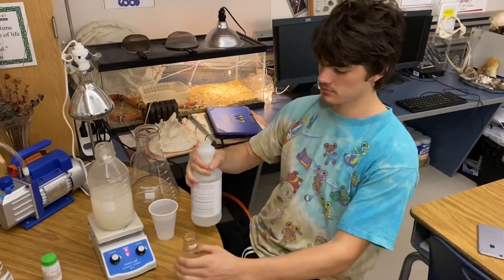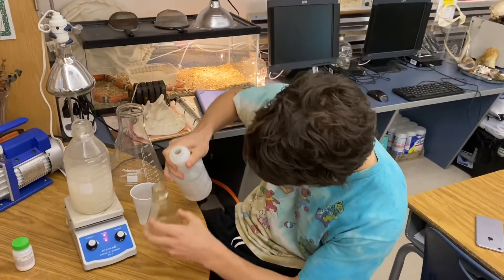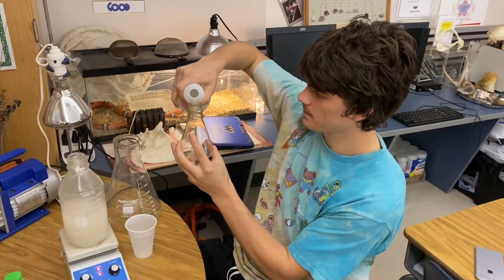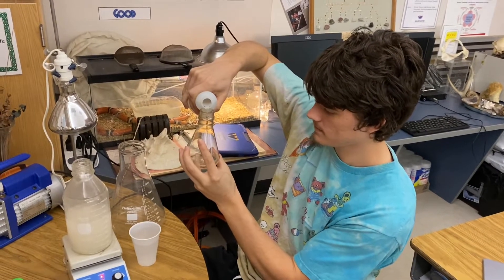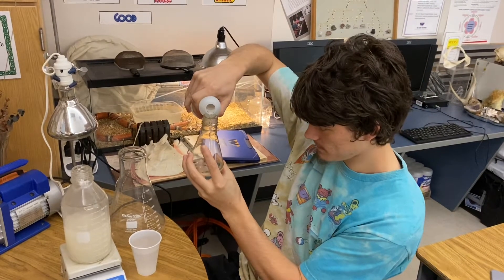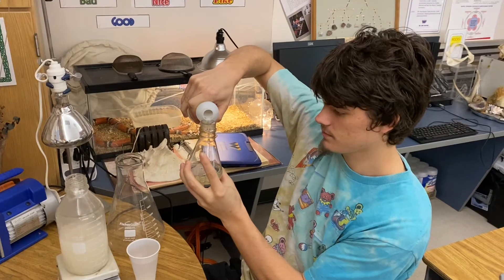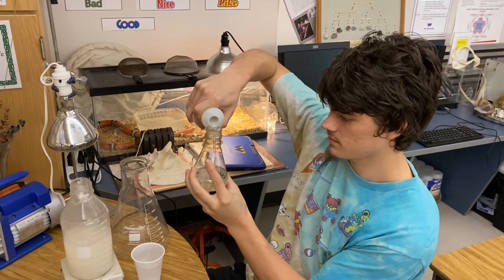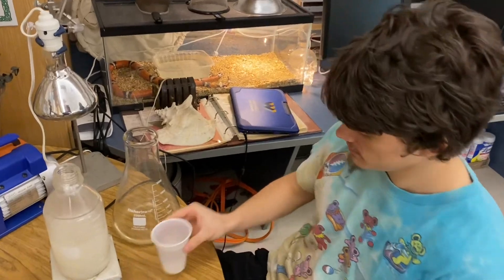Now Aiden is ready to add solution C. He's going to add 200 milliliters of 35% hydrogen peroxide and then dilute that to about 500 milliliters with water. So 200 milliliters of 35% H2O2, then dilute to 500 milliliters.